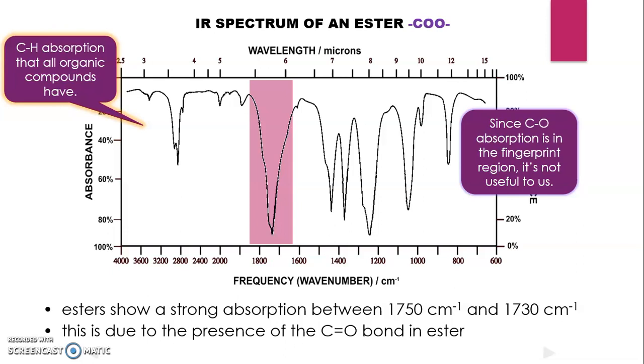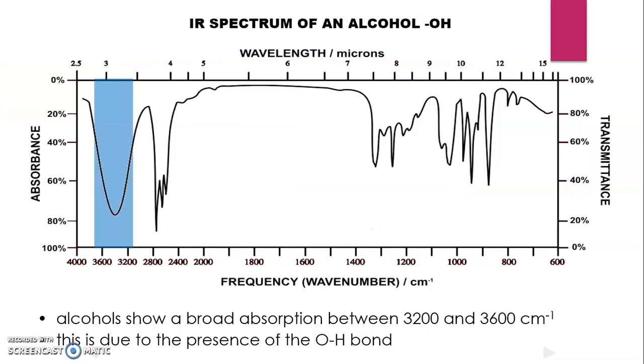That's why I said that IR alone cannot help us to pinpoint exactly what a molecule looks like. We have to use other information. A lot of times we really just use different regions to help us to identify a very characteristic kind of single bond or double bond. Okay? That's the ester.